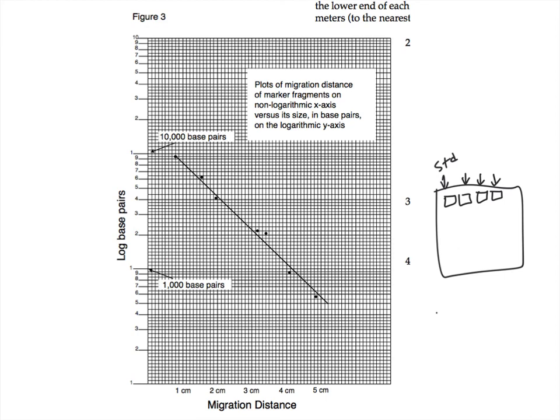It's very much like the protein quantification lab. So what I'm going to collect from you is both the table of your sizes and distance migrated, and this graph here.